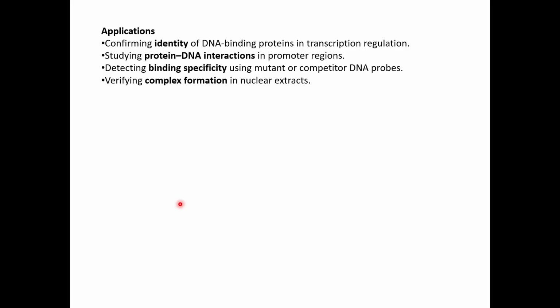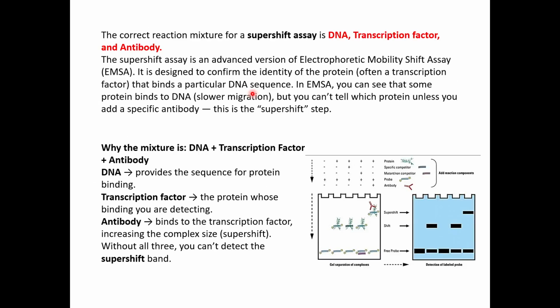Okay. Then applications of this are to confirm the identity of DNA binding proteins in transcription regulation, then studying protein DNA interactions in promoter regions, then to detect binding specificity using mutant or competitor DNA probes, then verifying complex formations in nuclear extracts. This was about the supershift assay.